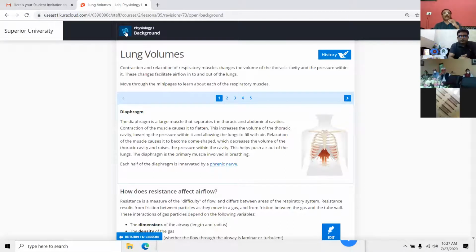Now, before going to theory, I just want to tell something about LabTutor. That is our old software that is no longer available. We have converted that LabTutor into LT. Basically, this is also LabTutor, but the LabTutor which we have stopped now would be installed on your computer. But this LT is not installed on your computer. This is online software. We will provide you the username and you will create your own password and you can work on it.